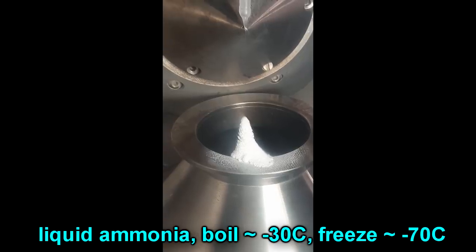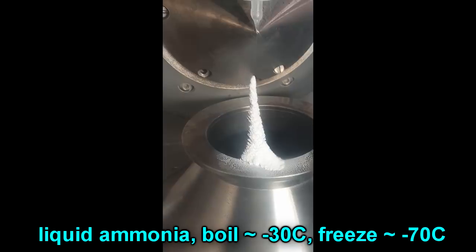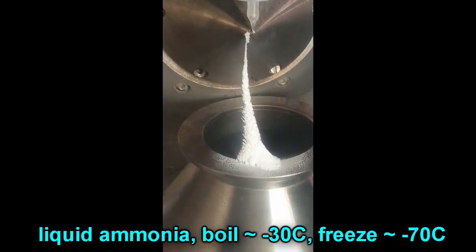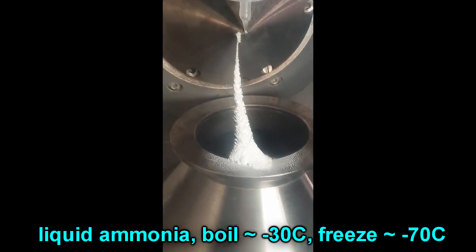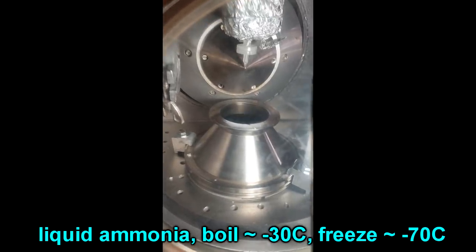The bottom line is that solid ammonia is actually quite stable in a vacuum chamber. What you see here is it just builds up from where the spray is always hitting in the same place and you get this stalagmite that just grows up and up and up until boom. Now it's cooled down the metal quite a lot but metal can still conduct heat. So eventually it just... don't jump, don't jump, don't jump. And boom.